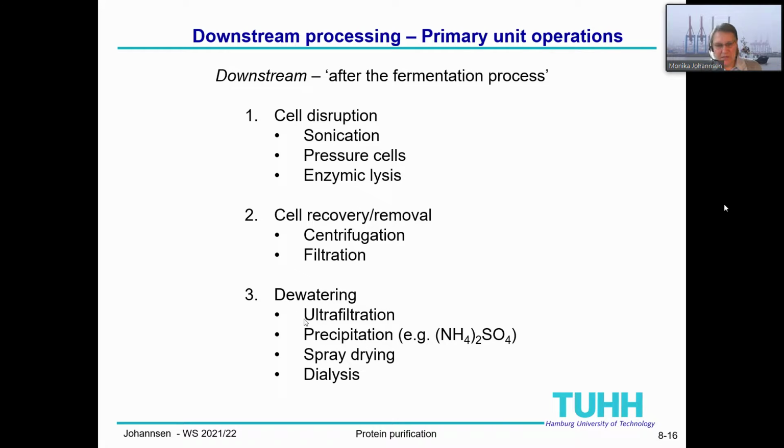Yeah, this can be done, for example, by ultrafiltration. It is also possible by precipitation of the proteins, by spray drying, for example, or by dialysis.